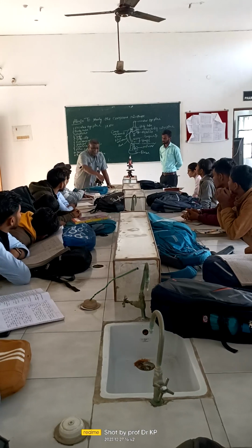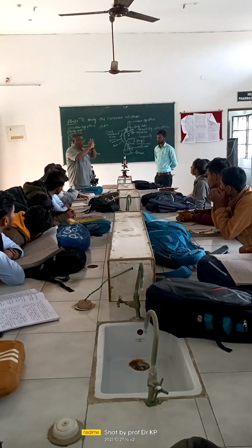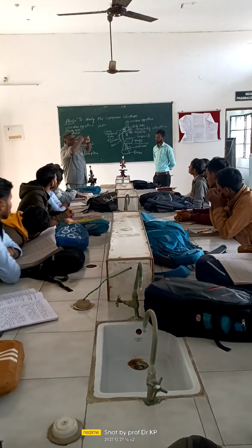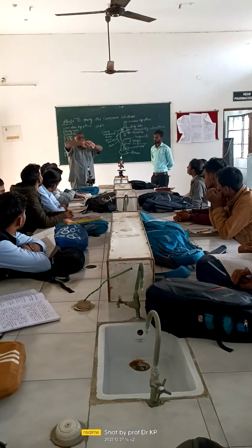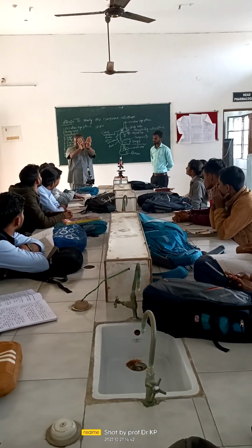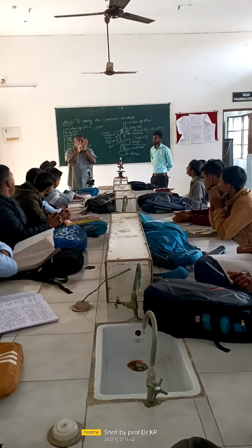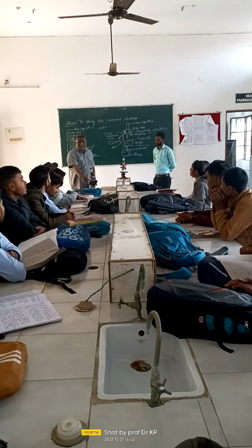The condenser will be having a diaphragm. The diaphragm is like a shutter, a camera shutter. It will close, and the spirally arranged blades are there. They will be able to close and they will be able to open. Like this: open, light will travel through the structure; close. You understand now? That is called a diaphragm.